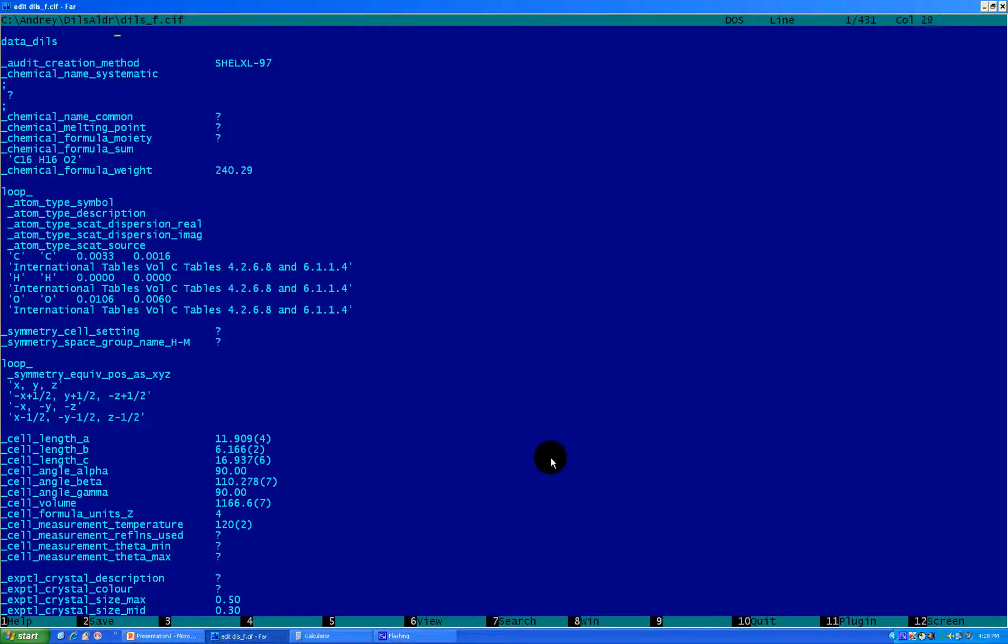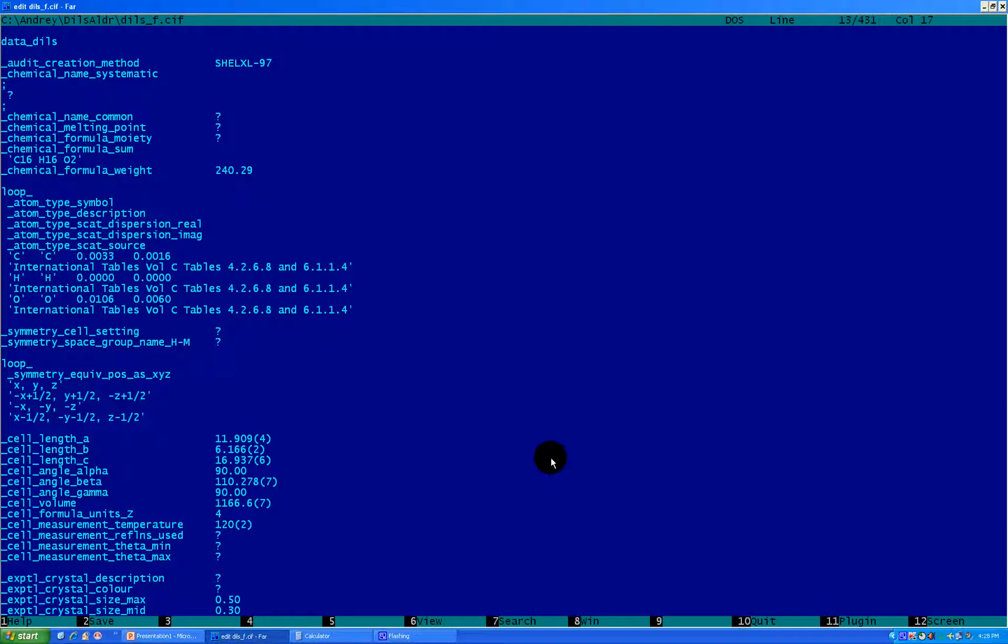Okay, first thing what you see in the first lines is chemical name, systematic - well you can fill it up, you may not fill it up, melting point - it's up to you. Some people do, some people don't, I usually don't do that. But what you need to fill up is chemical formula moiety. What does it mean? Well, here you have chemical formula sum, where it just simply sums all the atoms, and amount of all the atoms in your molecule, or in your actually asymmetric unit.